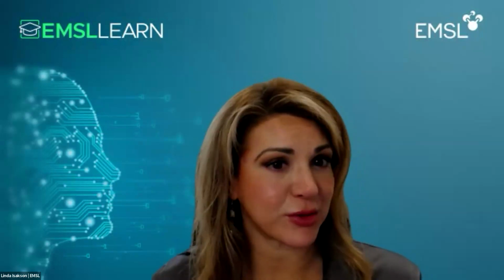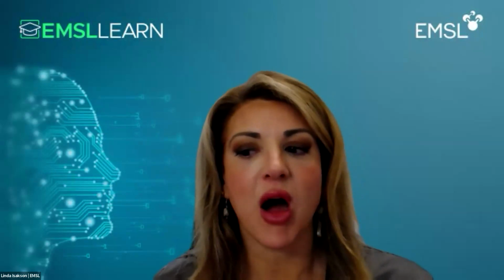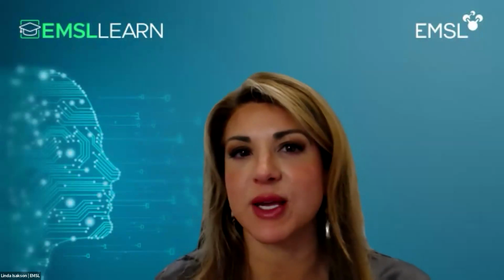All right. I'm not quite sure which one this would go to, possibly Shuttha. So this question: how reproducible are spectra from each soil sample? Yes, that's a very good question. First of all, it is not uniform, right? Each soil, even within the region, will be different. But we did several different runs, as Catherine pointed out.